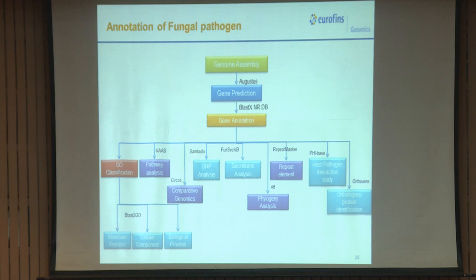They also have an online version, wherein for bacteria you can upload the genome and wait, because they are small genomes. You have online versions as well for those tools, but the tools which I am talking about, Augustus and others, are all terminal based ones. So, you can identify the genes. What it does is that they have a trained model already. For example, we are working on a particular genome. For that similar genome, a trained model will be there of that family or of that genome.